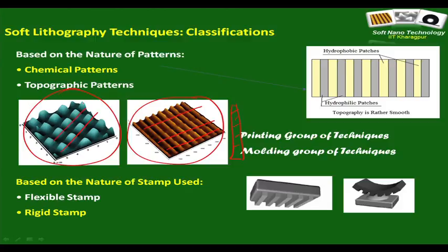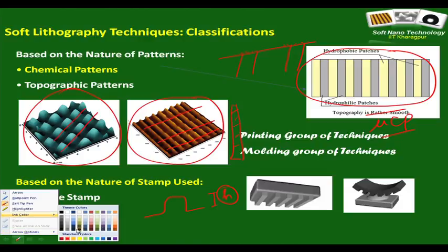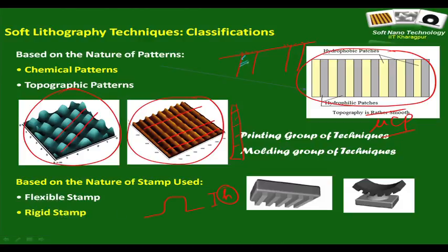Anyway, coming back to context, so now topographic pattern, we understand that they can be imaged very conveniently using an AFM, and you can get all the relevant information like their profile as well as their feature height, which is extremely important in the context of nano patterning or any surface patterning technique. But a question still remains unresolved. We talked about these micro contact printed surfaces, right, chemically patterned surfaces, and we argued that these surfaces have virtually no topography, but they have domains of different wettability like hydrophobic, hydrophilic, or different wettability contrast regions. So how does one image that, or is it even possible to image it?